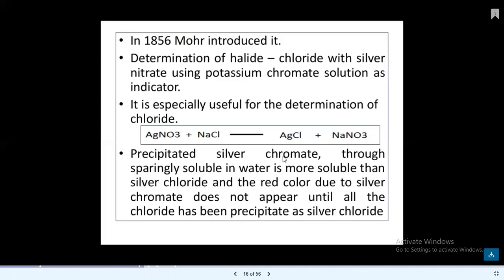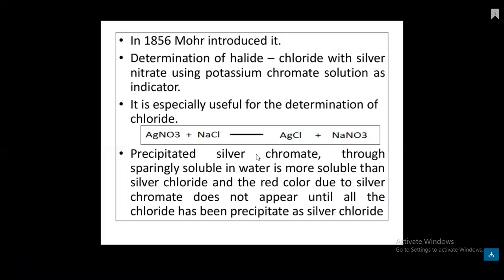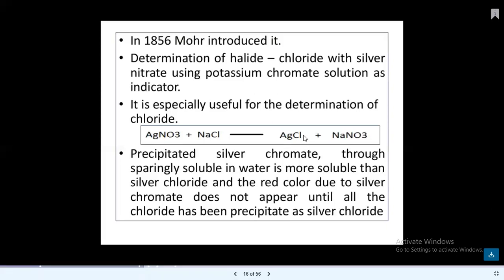So the precipitate that is formed initially via the addition of silver is not a stable one. When all of the silver is utilized by the chloride ion, the next drop, when there is no chloride, then forms a complex or precipitate with the chromate ion.